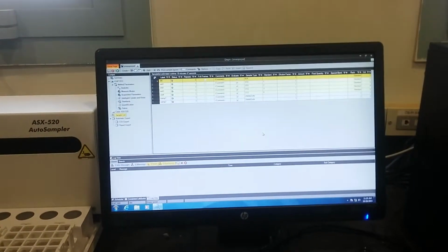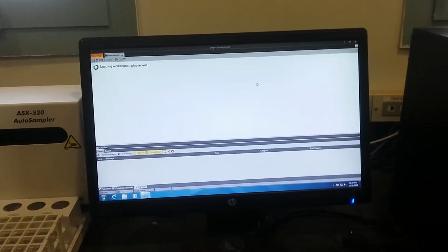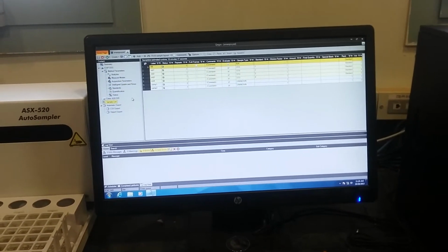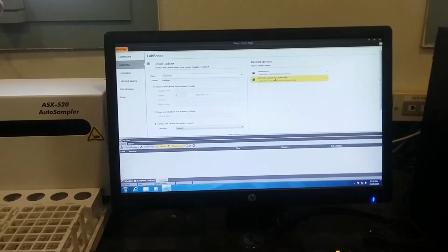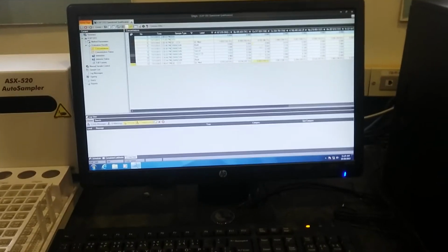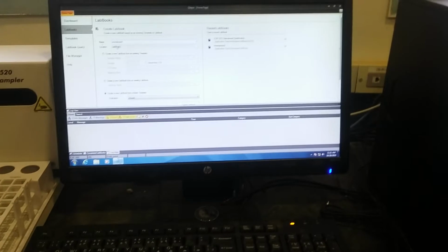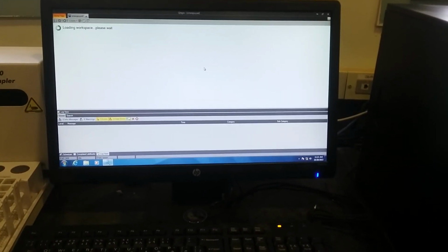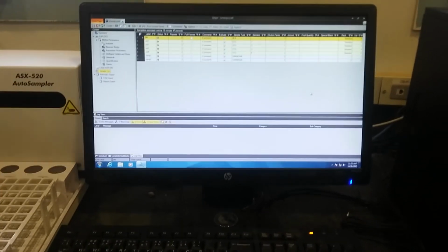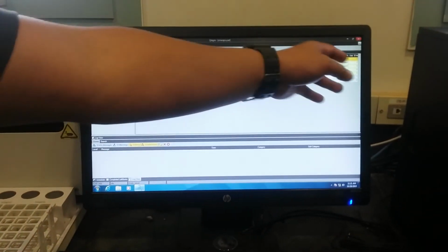It's not yet done. What is the difference? I will show. This one is finished. You will see, you have the result already here. The one that is not yet run, I will open. Nothing yet. Now we prepare the samples. Now you prepare a sample according to the table that you did.